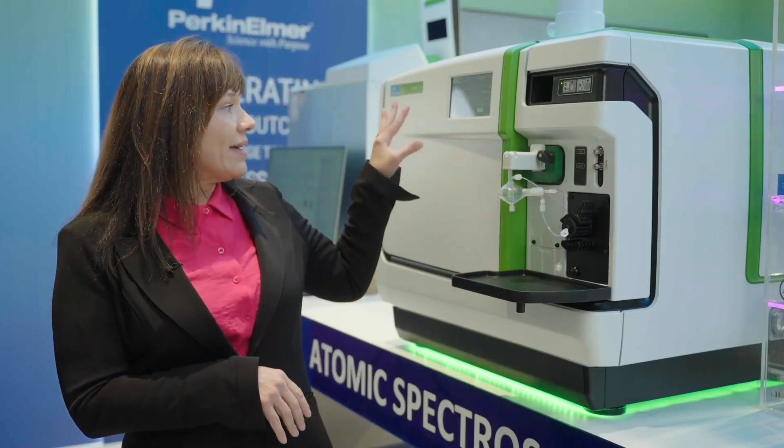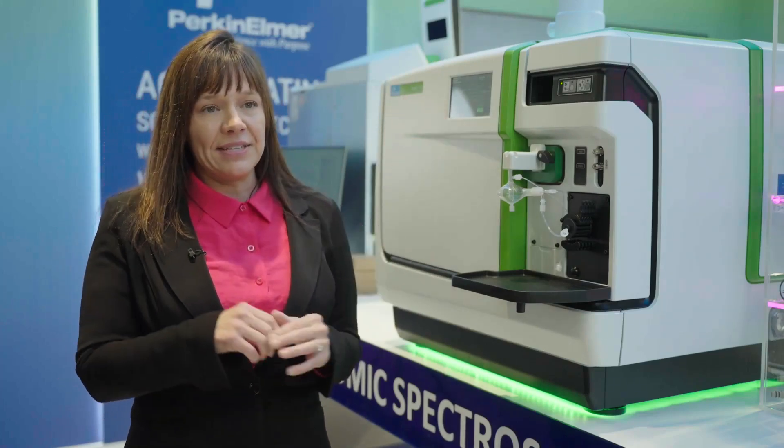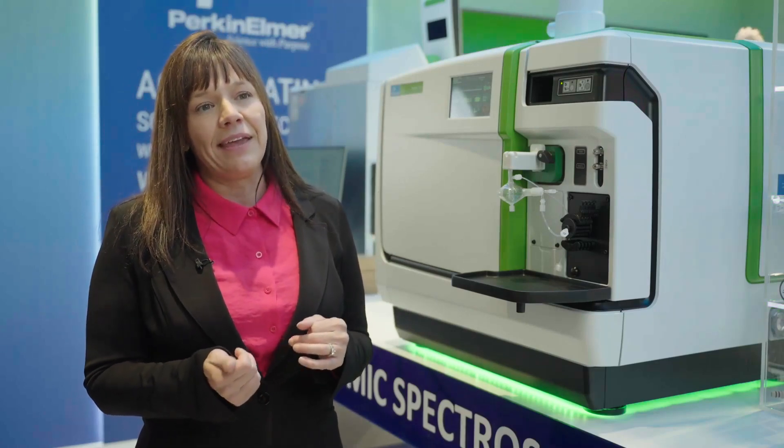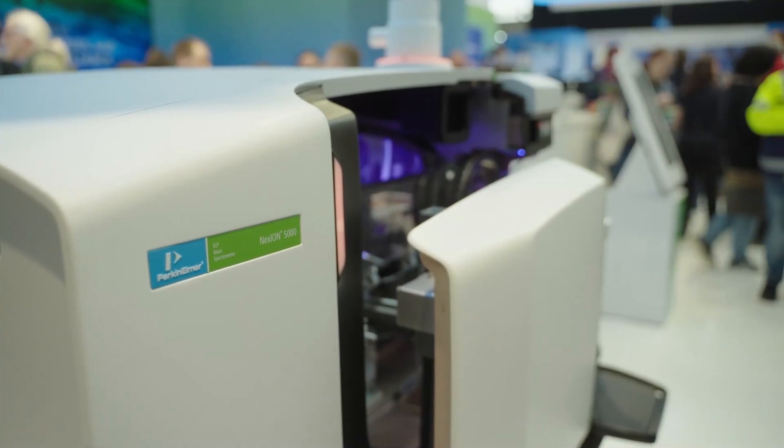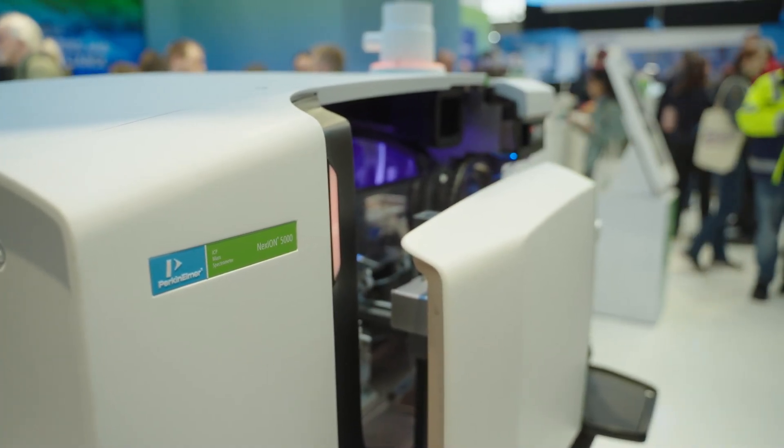The Nexion 2200 also has the LCD screen and the omni ring for extra sensitivity. Our highest ICP-MS platform is the Nexion 5000, designed to exceed the expectations of ultratrace applications such as semiconductor. In closing, the Nexion ICP-MS systems from PerkinElmer provide a wide variety of opportunity depending on your application, and deliver the lowest maintenance ICP-MS on the market.